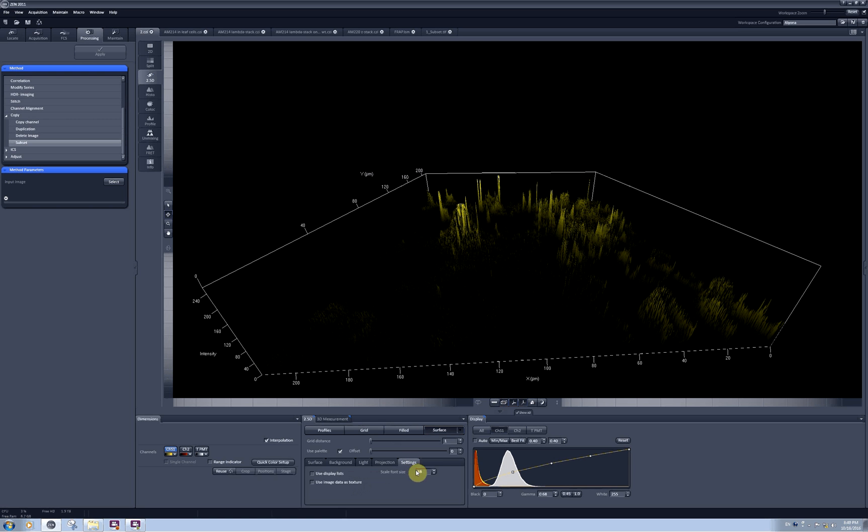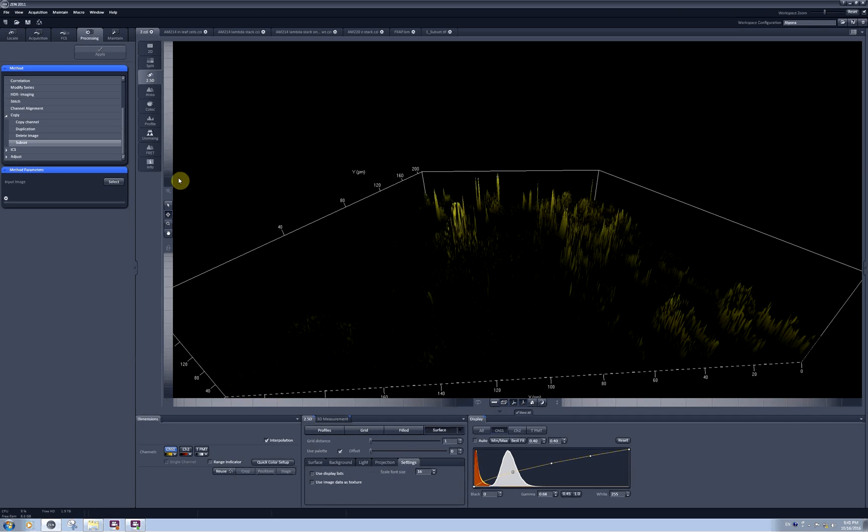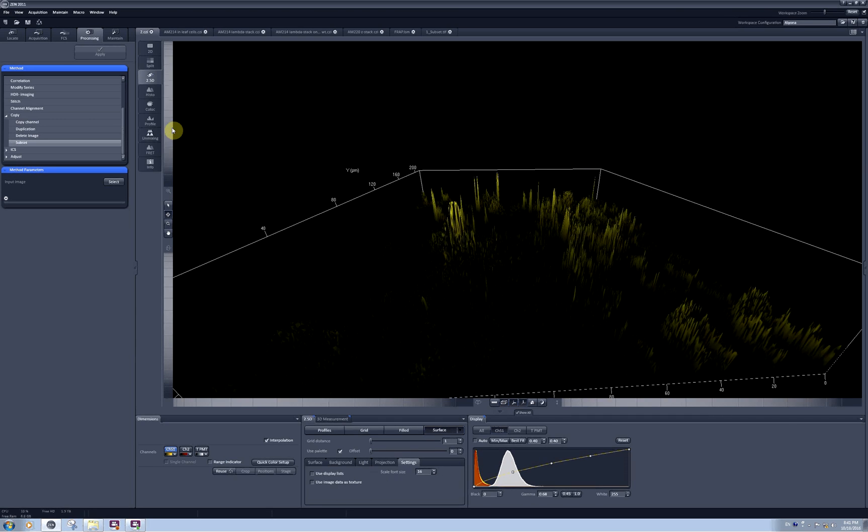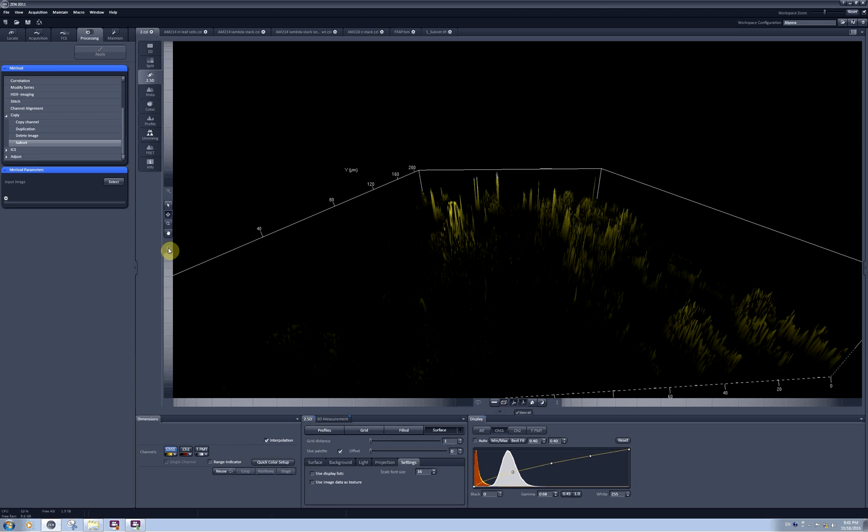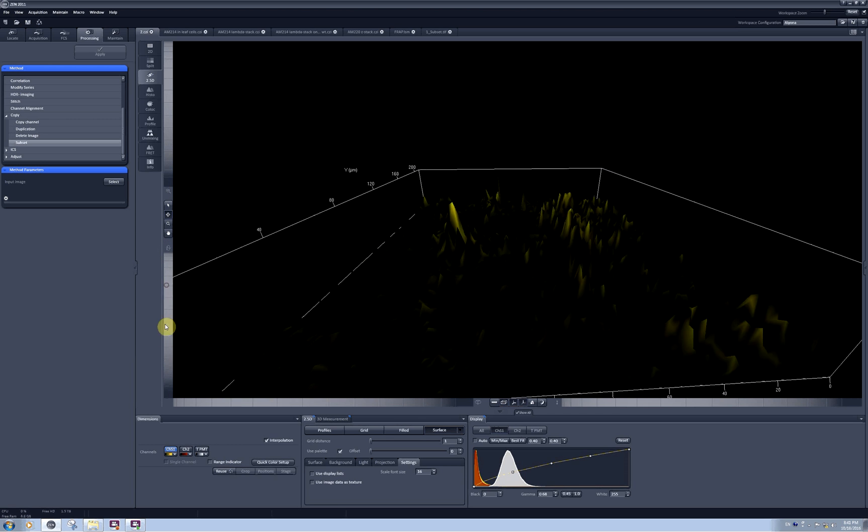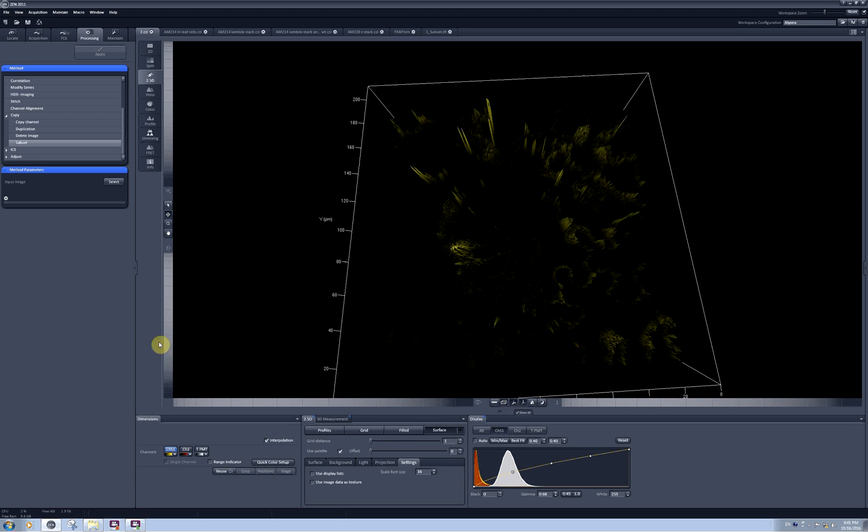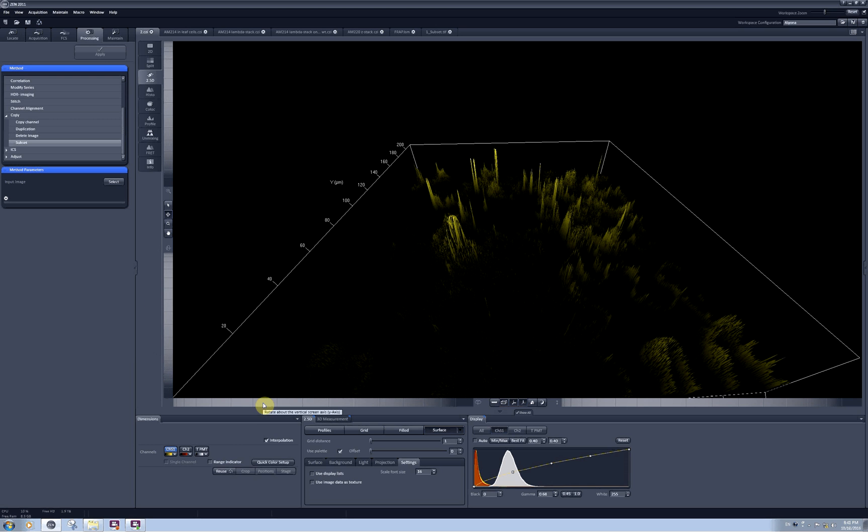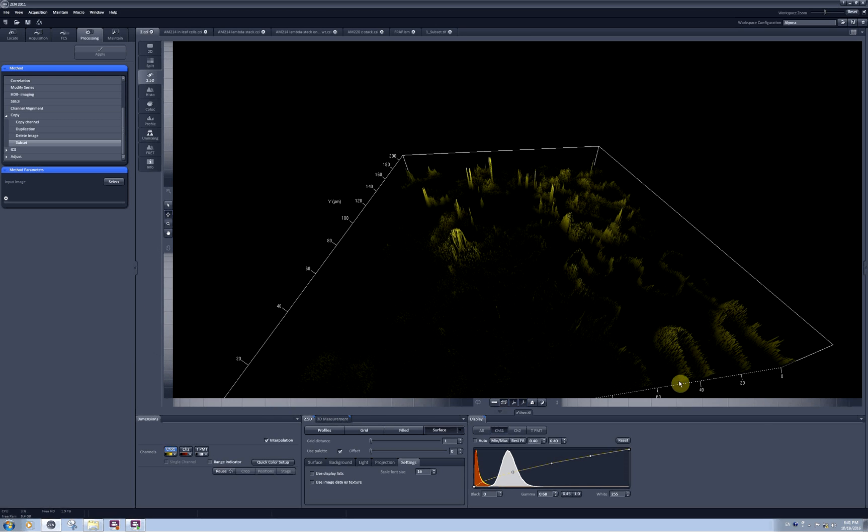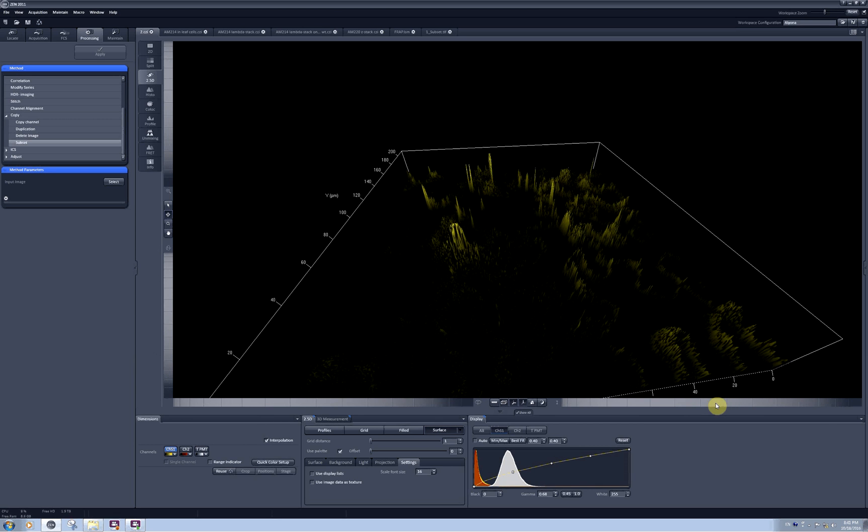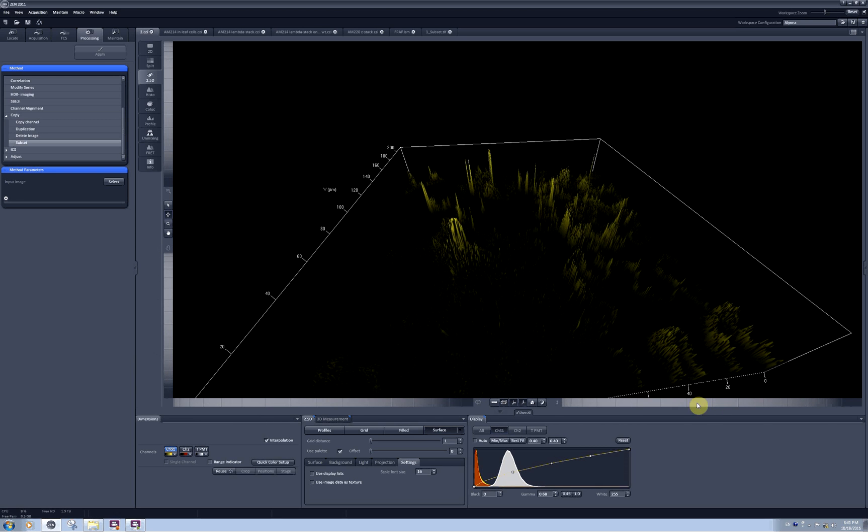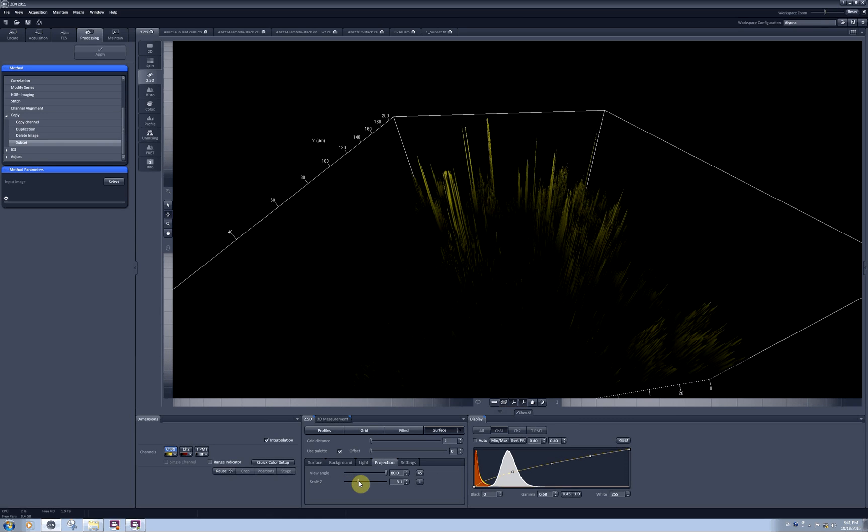And in the settings you can play with the font size and also display list. There are additional tools here. There is a zoom tool which is the scroll wheel on the top left. There is a wheel which allows you to rotate your model around its x-axis. Another wheel allows you to rotate around the y-axis. And this one will allow you to change the height of the z-axis. It's exactly the same as scale z here.